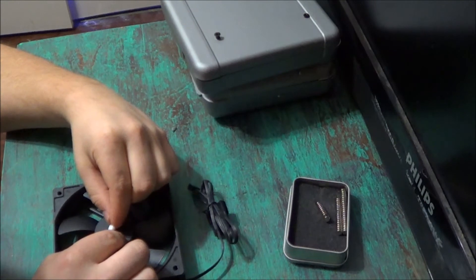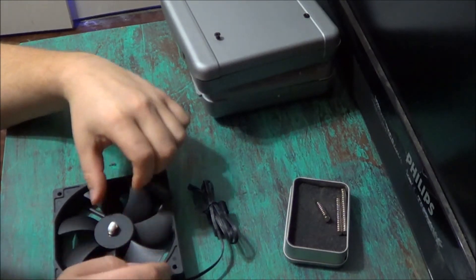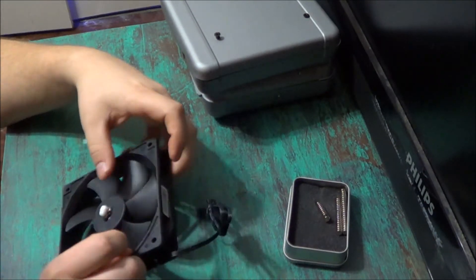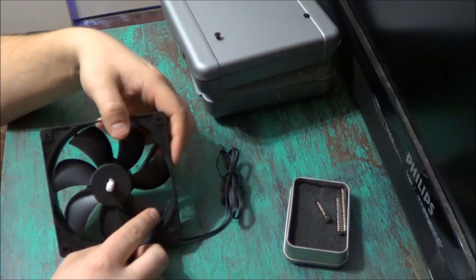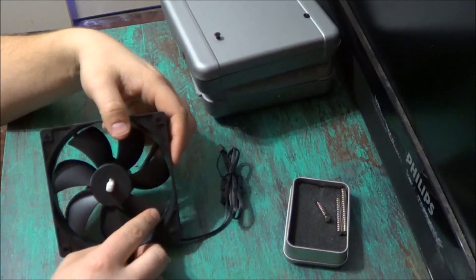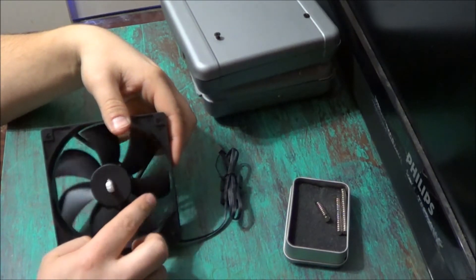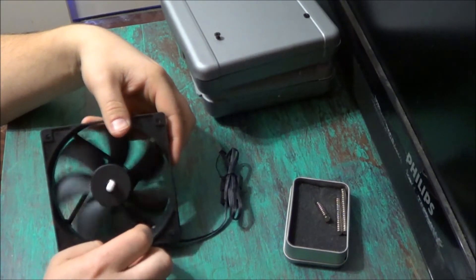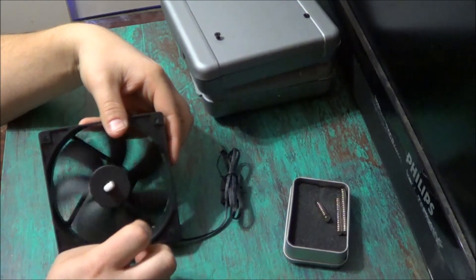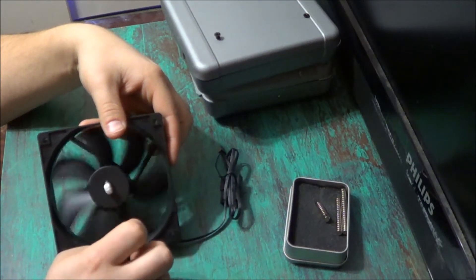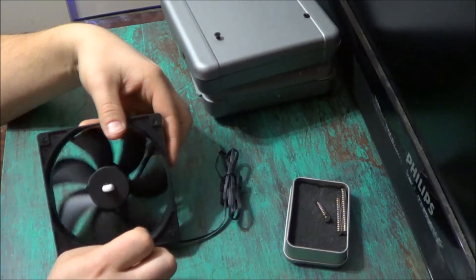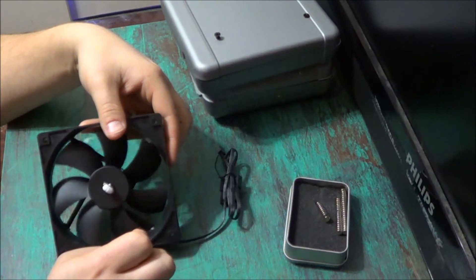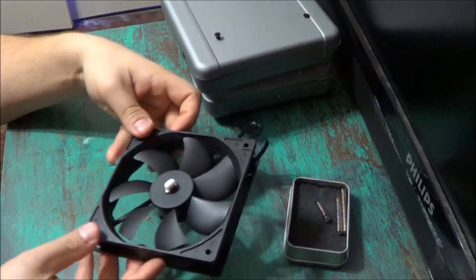Now the magnets will actually stick to the fan automatically on their own because of the metal that's inside the fan. So now we're going to let it spin, make sure that it's centered. And we're going to set our fan aside.